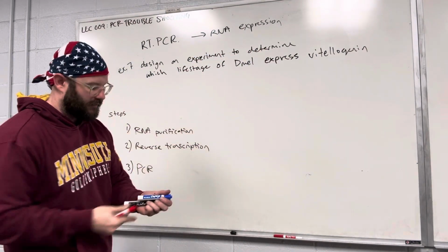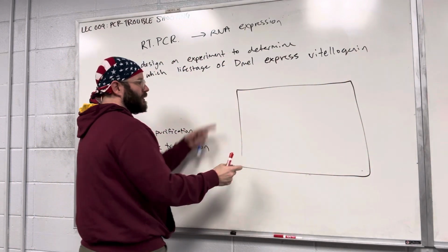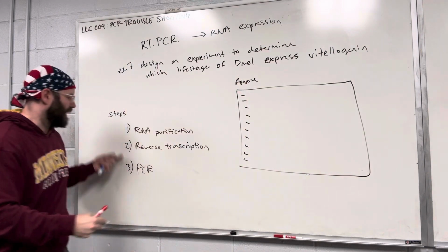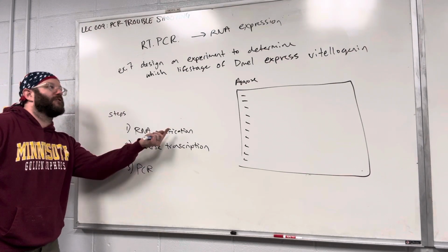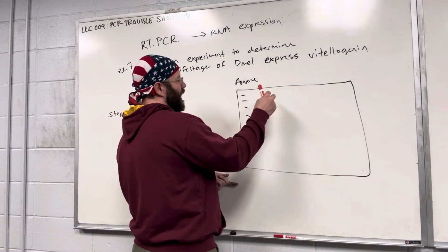So in this RT-PCR reaction specifically, you run a gel. You're gonna have a ladder. It's an agarose gel because in the end you did a PCR which produces DNA. So you're actually no longer studying RNA. You've produced DNA that came from a source of RNA, which you converted to cDNA, okay? And you run your samples.